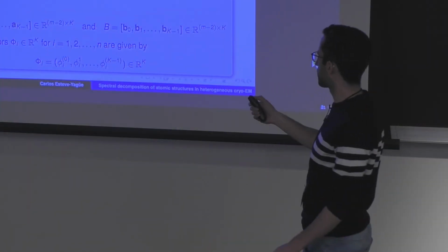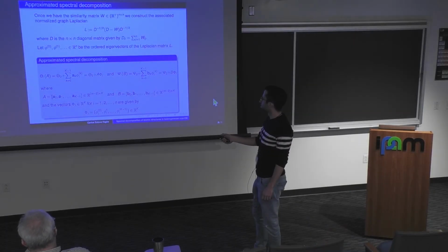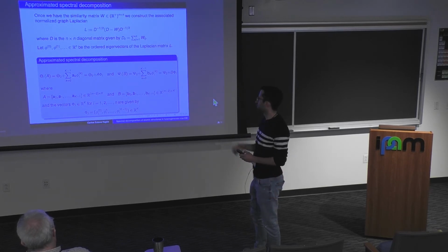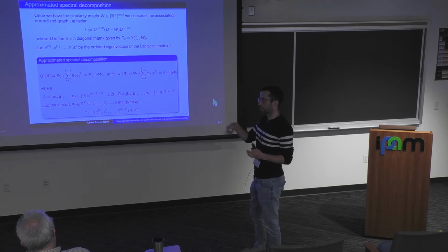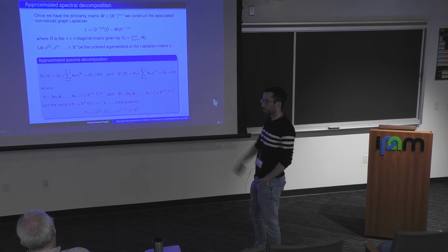But then, of course, it also depends on the structure of the similarity matrix. If it's sparse, then you can, for instance, as similarity matrix, take the nearest neighbors, and so I mean, there are ways to do it more efficiently. But this is the idea, to compute the eigenvectors.